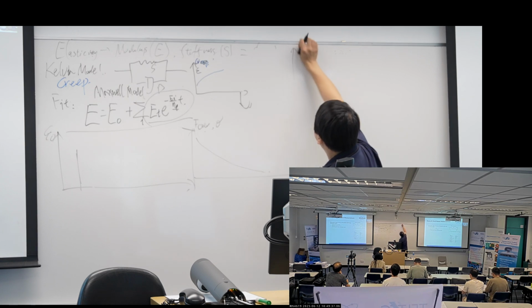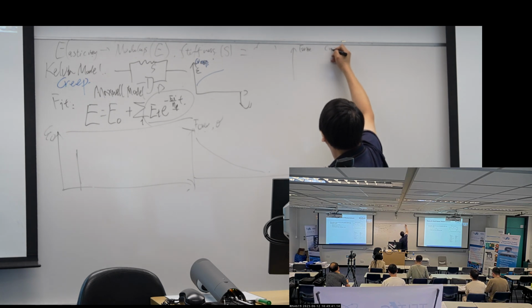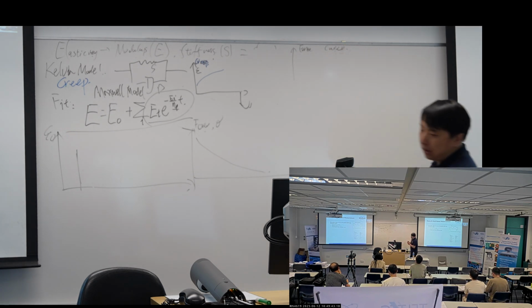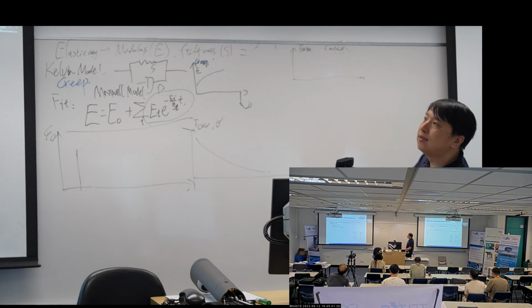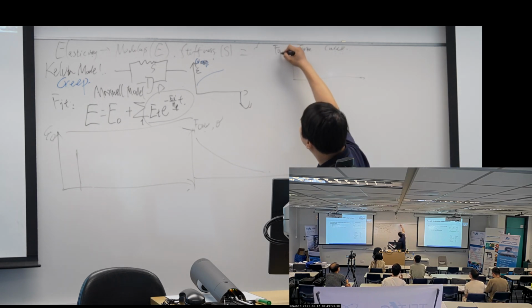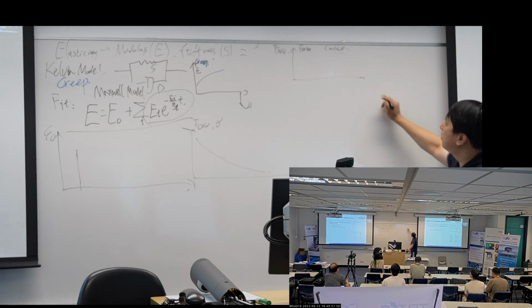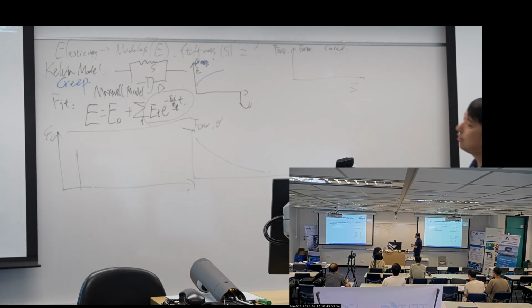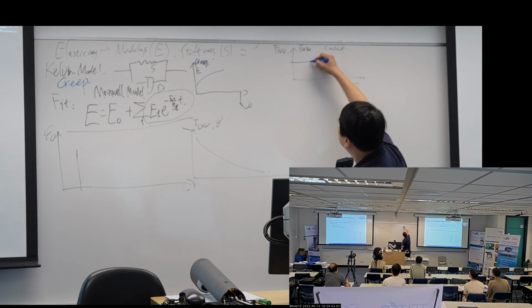Let's draw the force curve. So the classic force curve has the y-axis as the vertical, and after we do all the calibrations, now it's the force. And the x-axis, the original x-axis is the z, and then we do a force curve something like this.